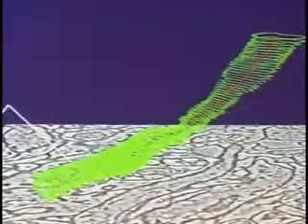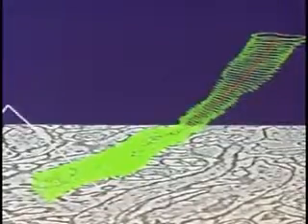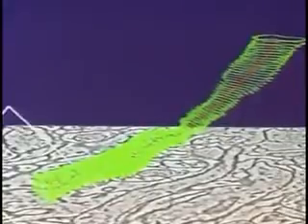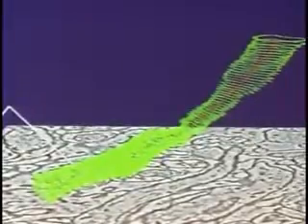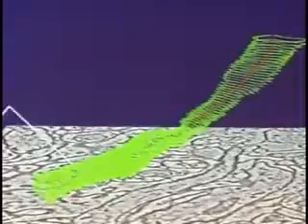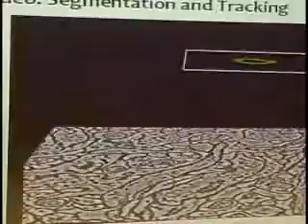Again, the main strength of this is that at any point during this segmentation and tracking, we are only accessing pixels from two neighboring cross-sections, and therefore we keep the memory usage and data bandwidth at a minimum. Also, we can easily parallelize this tracing process if we can track multiple neurons simultaneously on different computational threads.